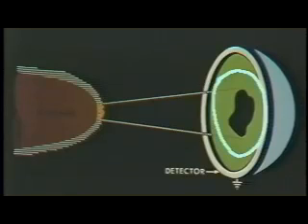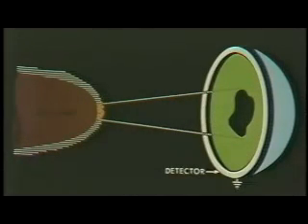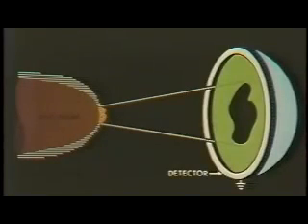It's sort of like, imagine a rock in a mound of snow, and you're melting the snow. You're subliming it, and you're looking down at it from the top. A little bit of the rock appears, and then a little bit more, and then a little bit more, until you've exposed the rock completely. That's sublimation in a high field, field evaporation or field desorption, and that's how we get our images. In fact, as the process proceeds, one exposes more and more of the molecule.